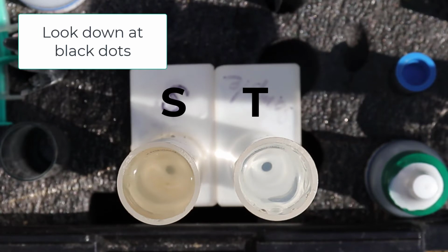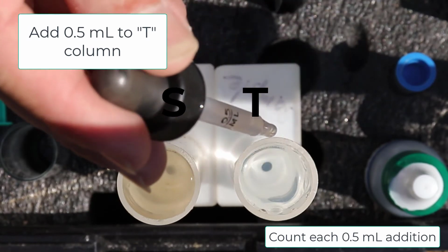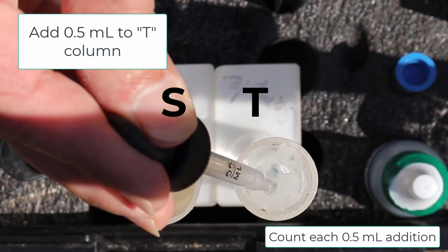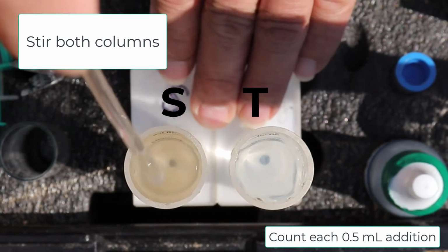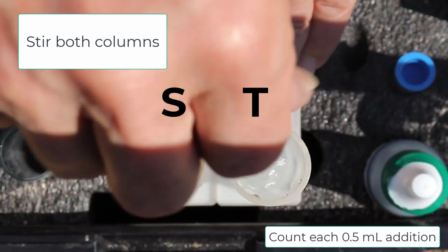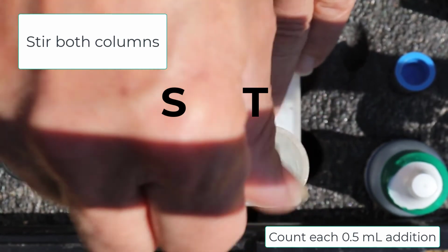If the T column is clearer than the S column, you will need to add the entire 0.5 milliliter of the reagent in the dropper to the T column. Make sure you dispense all the reagent in the dropper. Using the stirring rod, stir both columns, then look at the dots again.